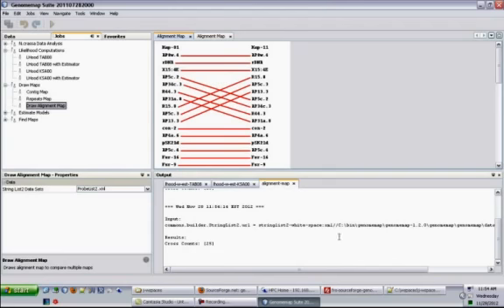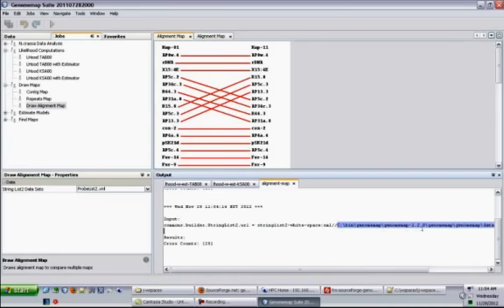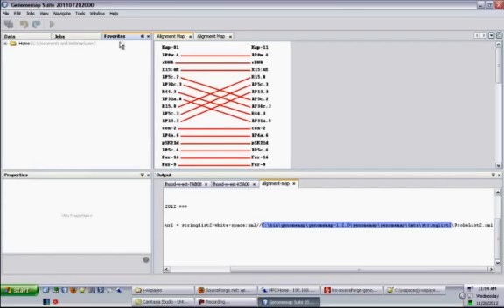One important thing is knowing the URL for the datasets. We can also choose where this dataset is coming from. Here is the URL that is given in the input. So this is the URL. If we want to edit the input file, we can get it. Let's select the URL here, and we can get to the file here.